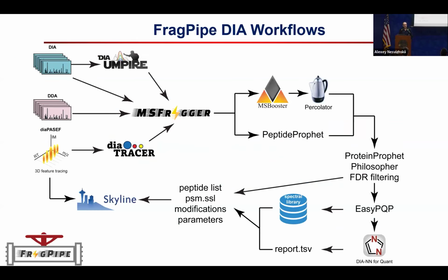Now, as far as DIA, data-independent acquisition analysis, we have worked on a lot of things in the DIA area. As you know, we were the first group that developed a direct DIA strategy, when everyone was thinking that DIA is a targeted proteomics workflow that requires spectral library building from DDA data and so on. So we had a tool called DIA-Umpire, and now we support all major workflows in FragPipe, and we still have our DIA-Umpire for certain applications. We still use it for immunopeptidomics data on Orbitraps, for example. That's our HLA non-specific DIA workflow that uses DIA-Umpire.